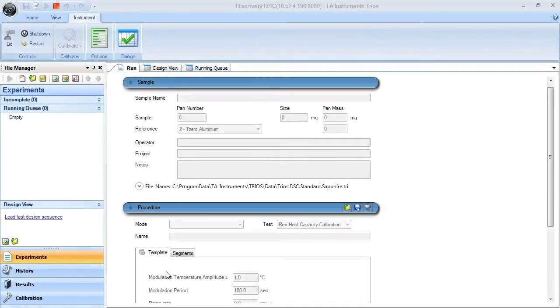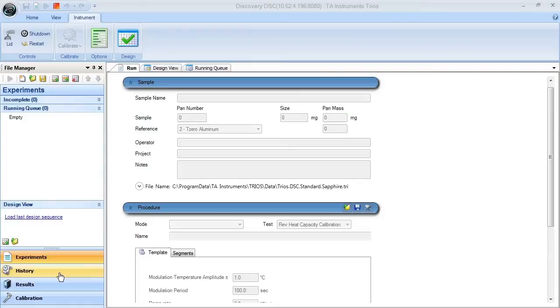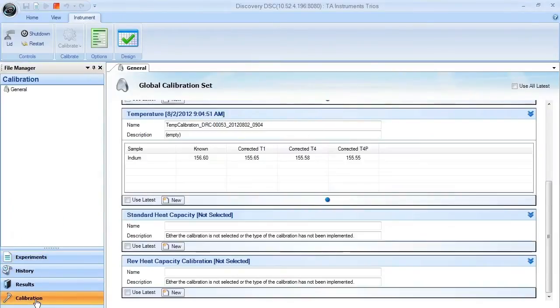To collect and analyze the calibration data files for sapphire on a modulated DSC experiment, you first need to select the calibration button. It will bring you to a calibration data set here.